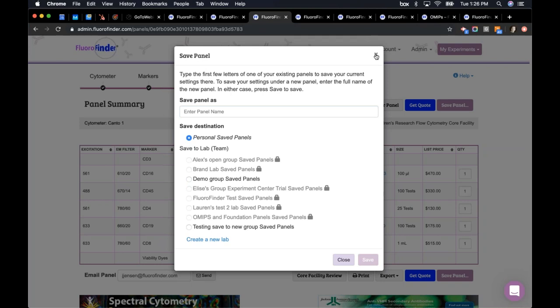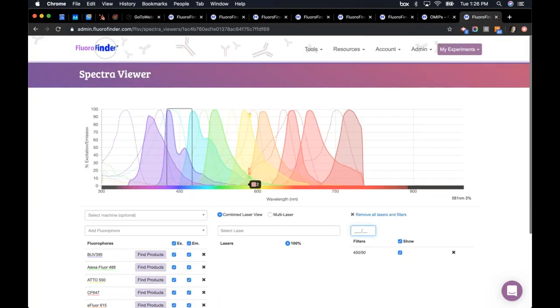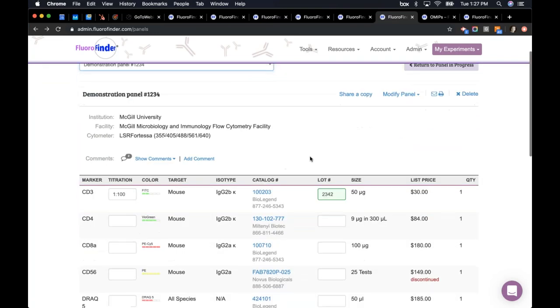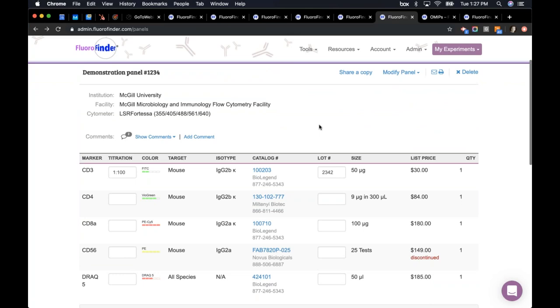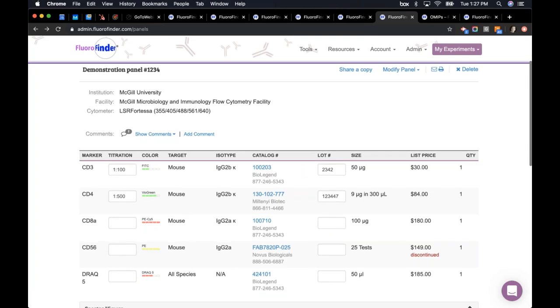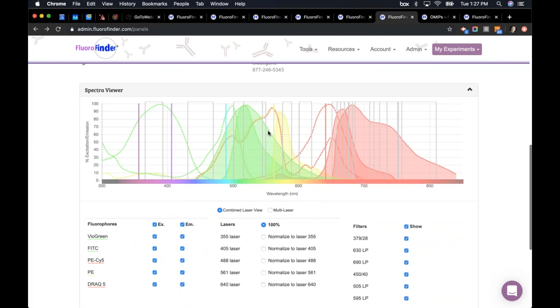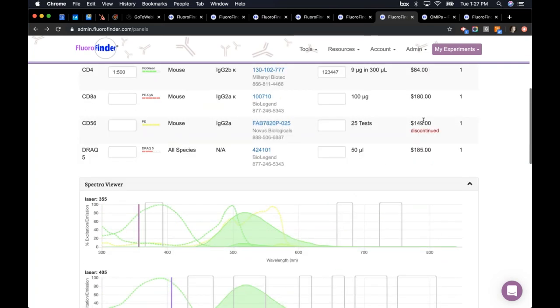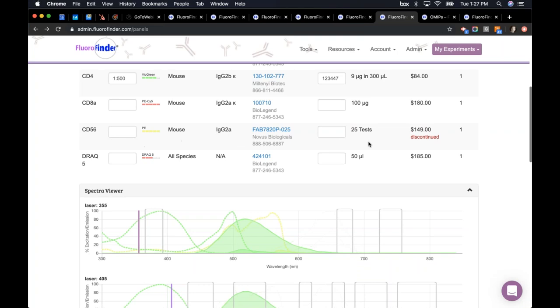Anybody within that group is going to get a copy of this panel so they can work on it together. On the saved panel page, here's a list of all the panels I've saved in the past. We try to support the design experiment and the life cycle of the experiment all the way through from design to finish. After you run the experiment, you can come back in here and enter your titrations and lot numbers — these are all dynamic fields — and add comments.